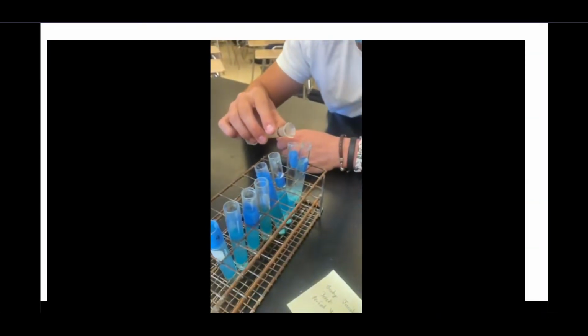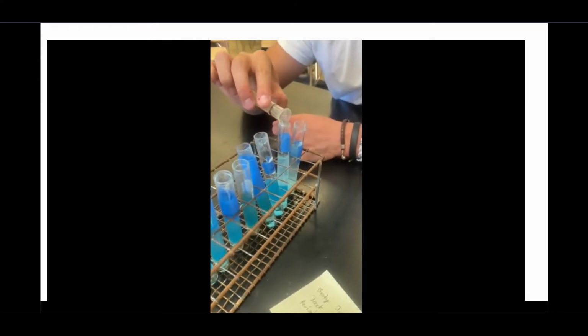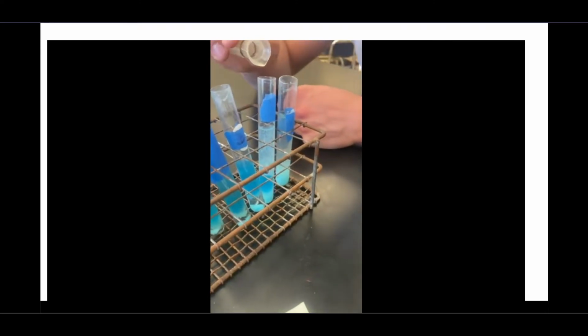In this experiment, we will see what is called precipitate, which is a solid, and a supernate, which is a liquid that rests above the precipitate.